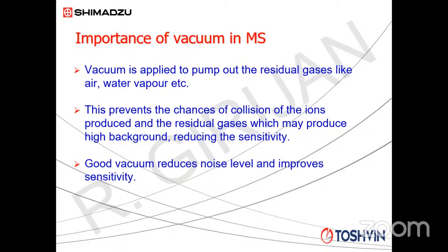And you imagine you are not applying vacuum. You are directly starting the analysis. Just hypothetical. You are not applying any vacuum. What will happen when your sample undergoes fragmentation and there are a lot of nitrogen molecules, a lot of water molecules, a lot of oxygen molecules because of the air inside? Your sample fragments will collide with all these gas molecules, like it will collide with nitrogen, water vapor, oxygen.